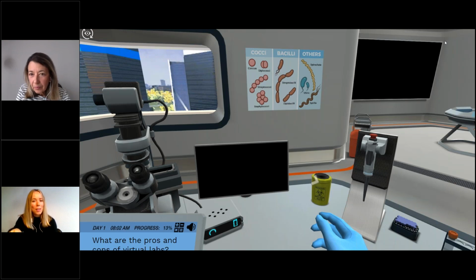So I really want to show one of the simulations that you have been using, which is bacterial quantification by culture. This is just a quick screencast, a video recording basically of the simulation. So it's not, of course, how the whole simulation goes. We're going to go back and forth and see a few things in there. But it's a short video, and I'm going to show it here live.